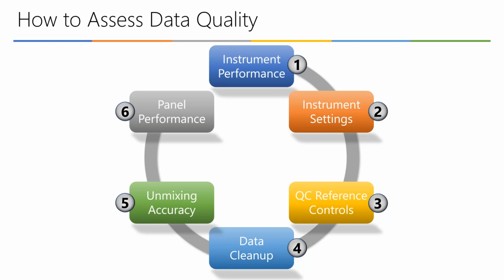Very important consideration. Yes, the software has the capability to reuse controls that have been stored. But in order to do that, multiple things need to be confirmed. Your instrument needs to be working perfectly. You need to confirm that the QC pass, that the instrument is stable, that your signal across all the different detectors is stable, and also that the linearity between the gains and the intensity of fluorescence is maintained based on the APD functioning. That's one thing.